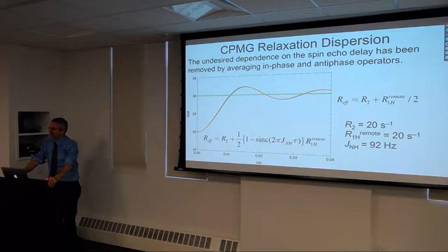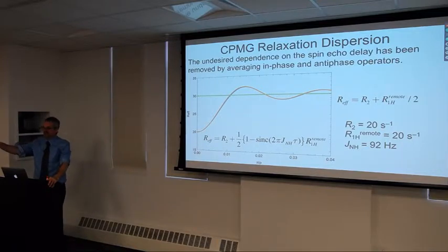When we did this the first time around, we thought we needed more compensation, so in fact we did it twice. We had a block of CPMG pulses, that U element, a block of CPMG pulses, another U element, so that we could get compensation to second order. But it turns out in practice that's hardly needed, and it just costs you more relaxation losses. So if you look in the first paper, we showed it with 2 blocks, but since then people have mostly just used 1 block. It turns out to our surprise, we only did this for the NHs, but in addition to working for IS spin systems, it also works for I2S spin systems and I3S spin systems.